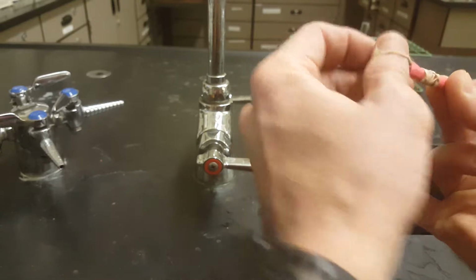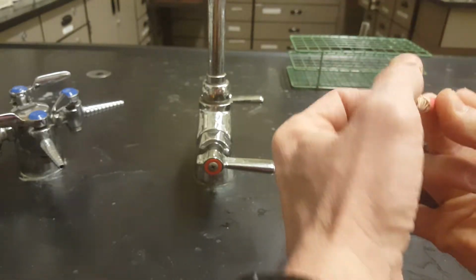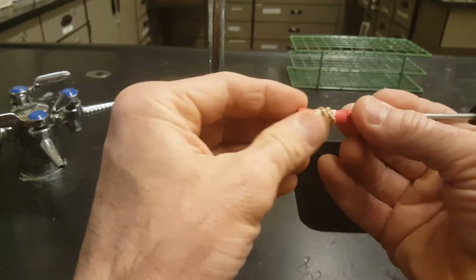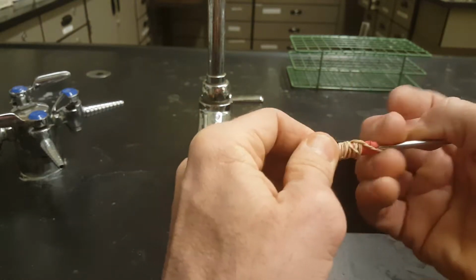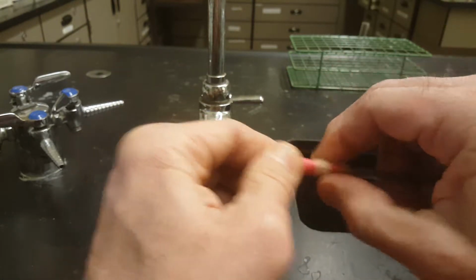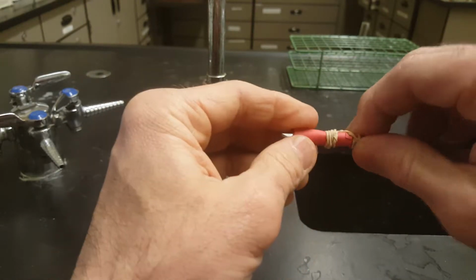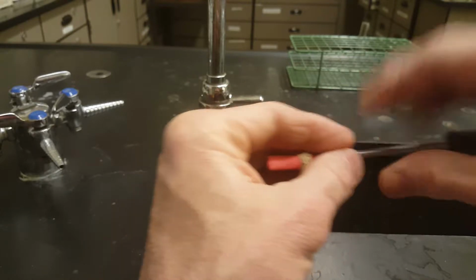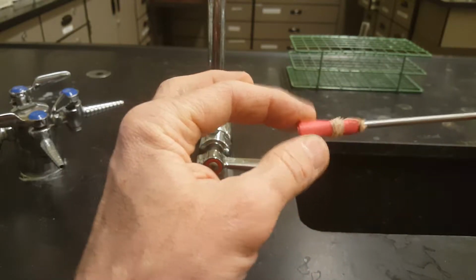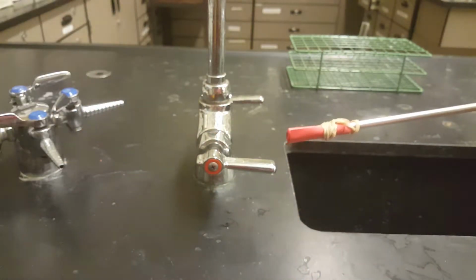And so what I like to do is get this on nice and tight, and then roll part of the rubber band up so that it's also on the shaft of the thermoprobe, like that. Cool, and that's going to keep the paper from falling off of the end of your thermoprobe when you soak it in your volatile liquids.